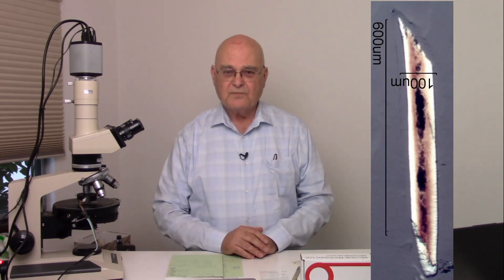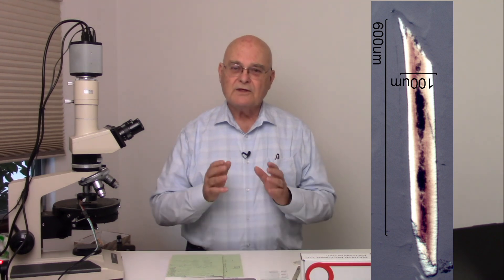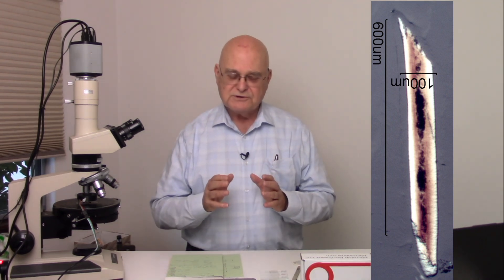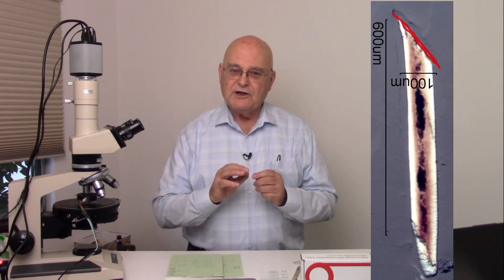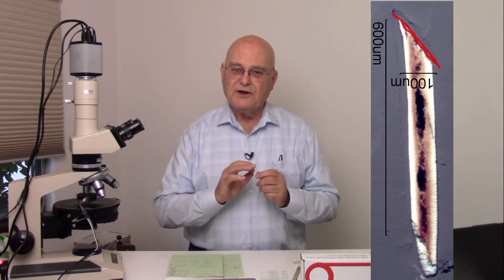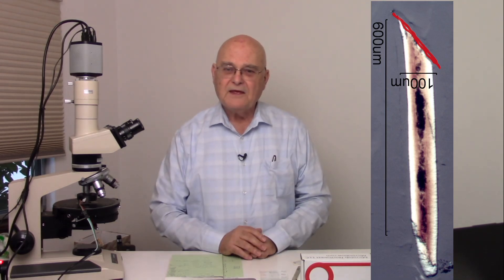We'll see whiskers from shaving or from grooming a beard. They have characteristic structures where the whiskers have been cut. We can see if they are cut every day or two, or if weeks go by before they're trimmed. All of that shows up in the structure of the hair.